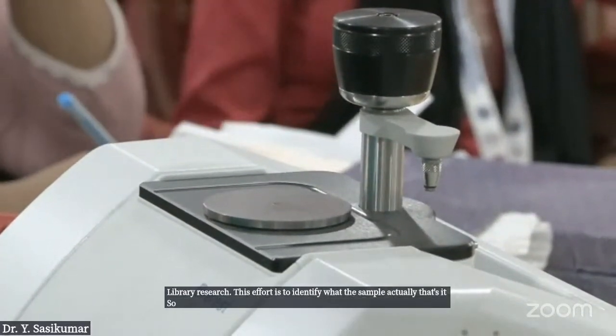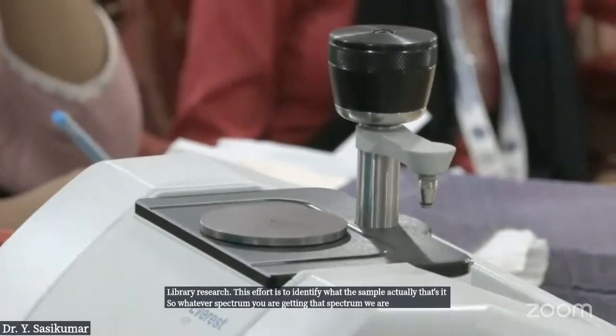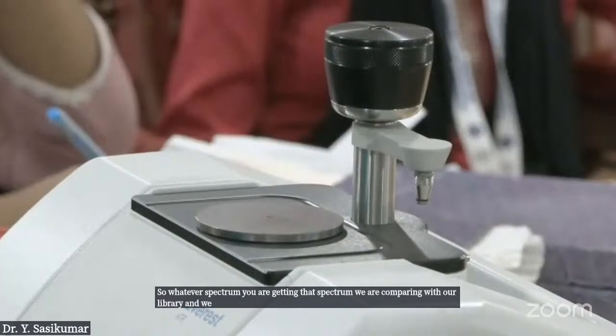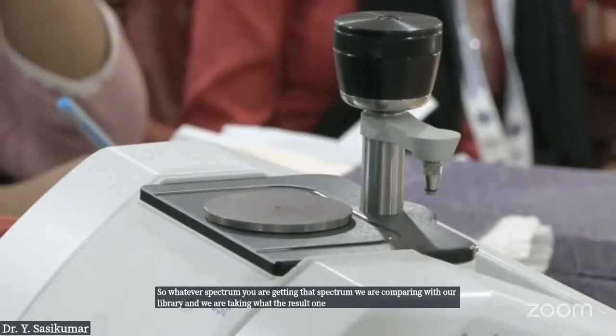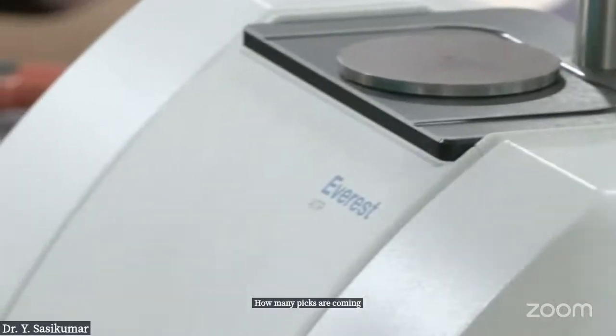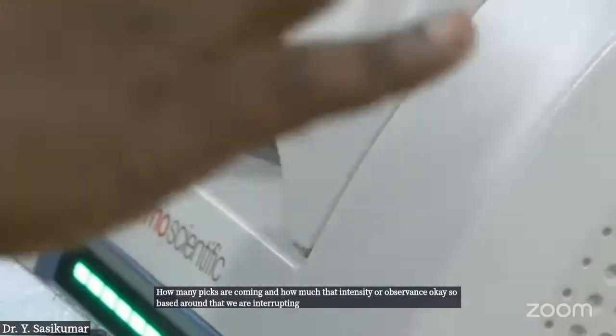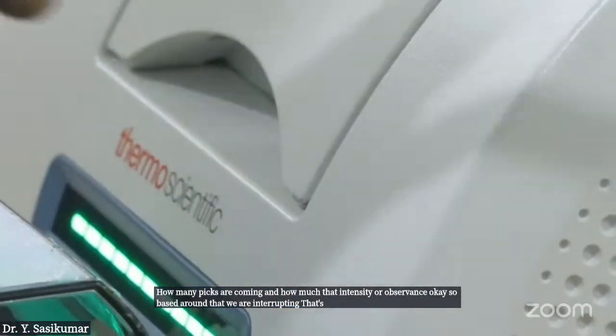Whatever spectrum you get, we compare with our library and take the result. Another thing, we check the peaks, how many peaks are coming and how much their intensity or absorbance is. Based on that we are interpreting. That's it. Very simple only.